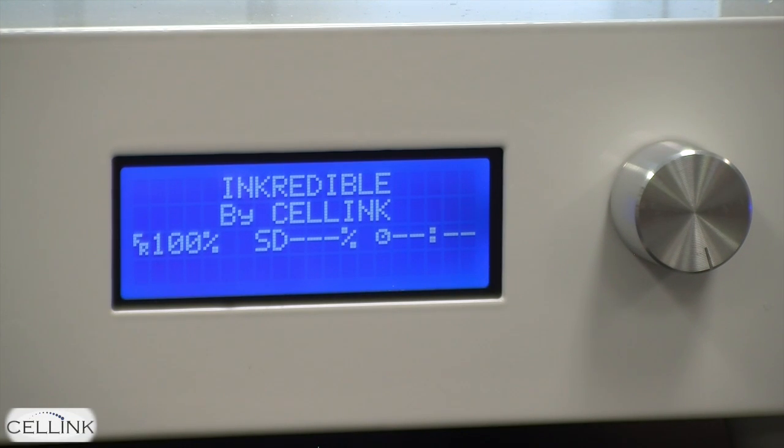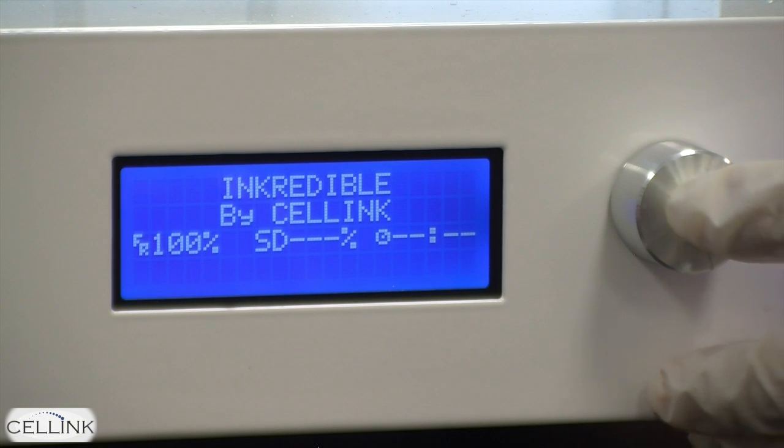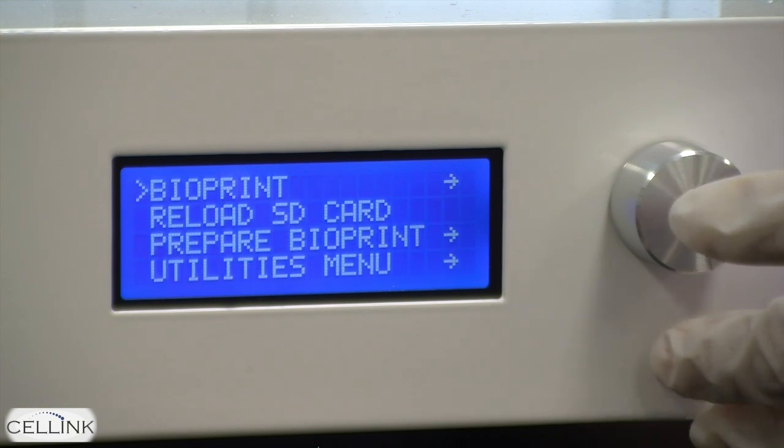Hi everyone, today we're going to review some of the special settings of the bioprinter. When you press the silver knob, you have a number of different options on the bioprinter.